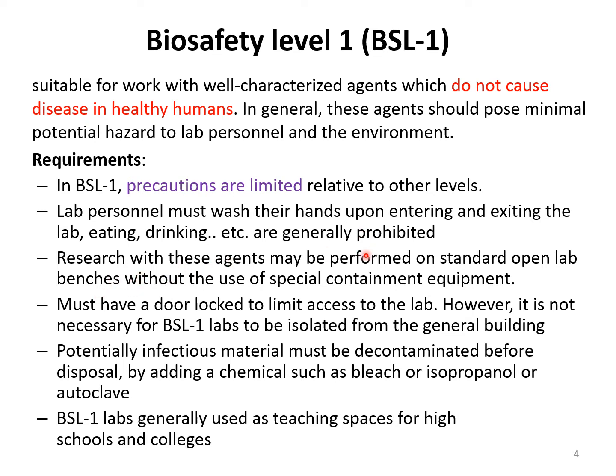Eating and drinking, as we commonly discussed before, are not allowed in this lab. The agents may be handled on standard open lab benches, so we don't specifically need cabinets, laminar flows or safety cabinets for BSL1 microorganisms.